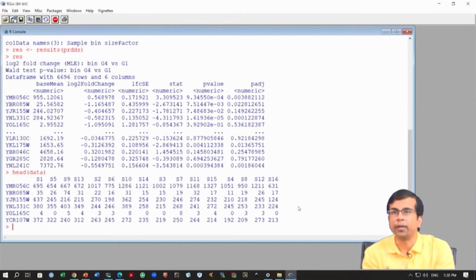Let us imagine you want G4 versus G3. What you have to do is maybe just create a file with only G3, G4 or reorganize this data so that G3, G4 is there in the first and the last columns. By default, when you have this kind of data, you will get this G4 versus G1 result. But this is what we want in our analysis, because G1 was the most interesting group if you remember from the preliminary analysis. So, this is good, we have generated this data.